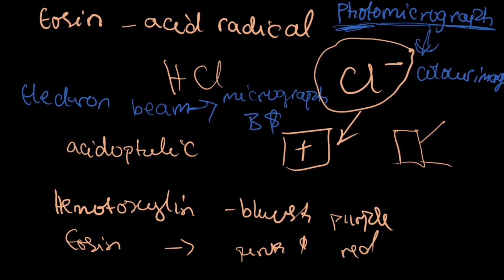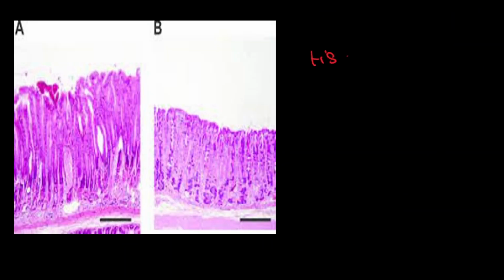We have them in black and white, and this is because the electron beam doesn't have a color spectrum. Here is a picture of a tissue slide that is stained in hematoxylin and eosin. We can see some purple, I can't really see pink and red, but I can see the purple appearance from the hematoxylin.